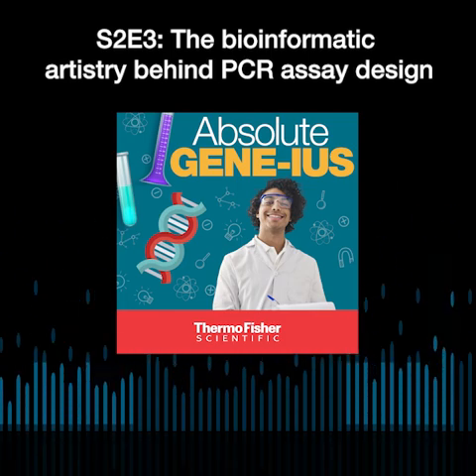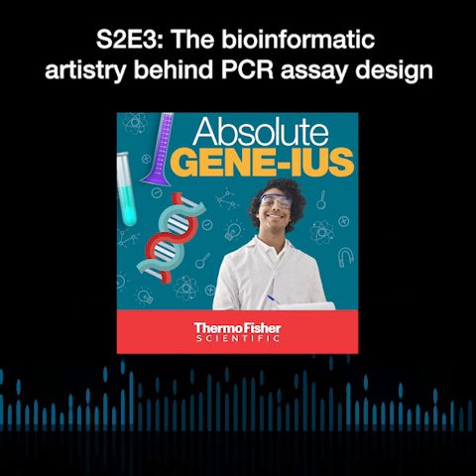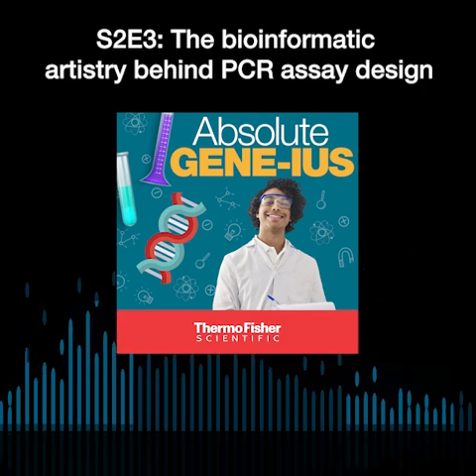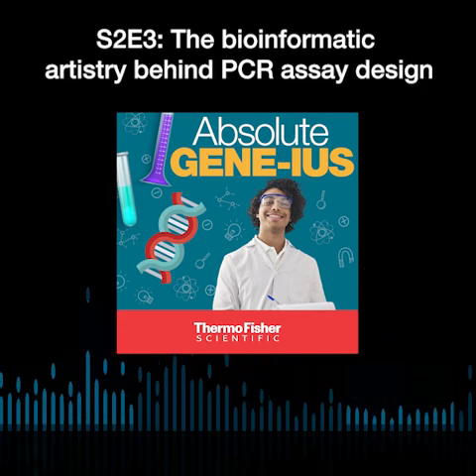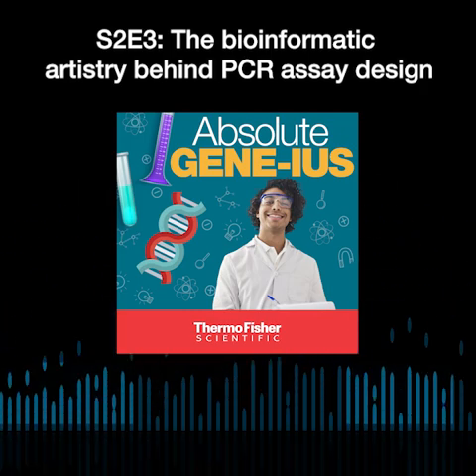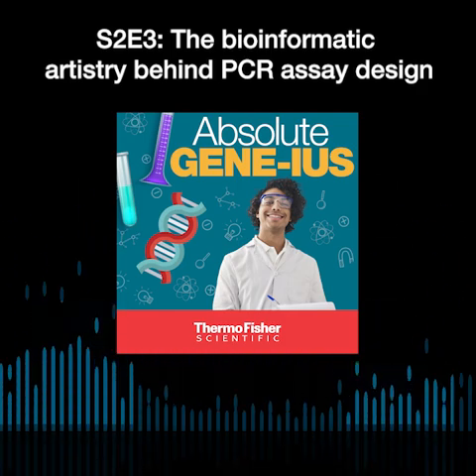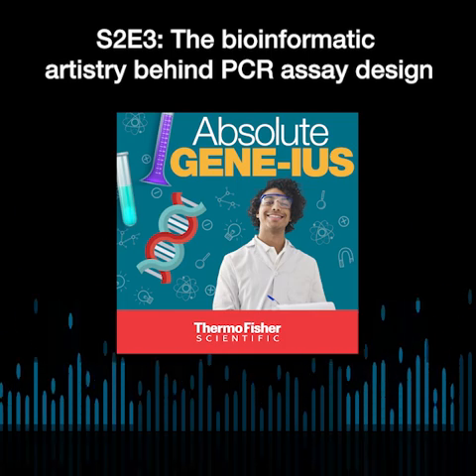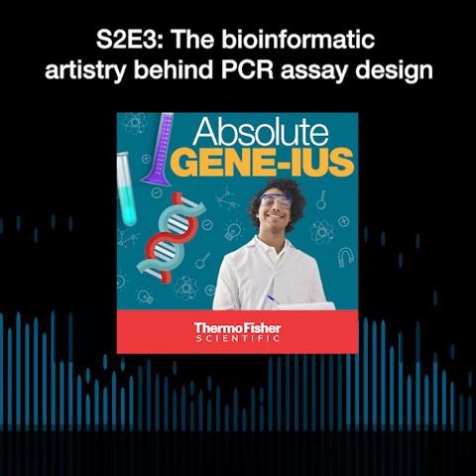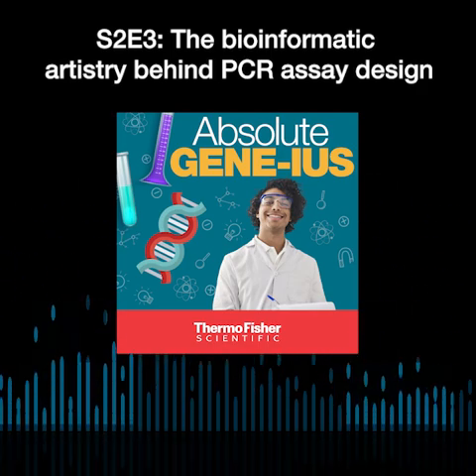So NCBI is basically a large repository of sequences. Anybody who's an aspiring bioinformatician would benefit from acquainting themselves with NCBI because they have several databases as part of it. They have done a wonderful job of cataloging all the genome sequences, but also cataloging known single point mutations or multiple nucleotide mutations. And so that's a good reference point.